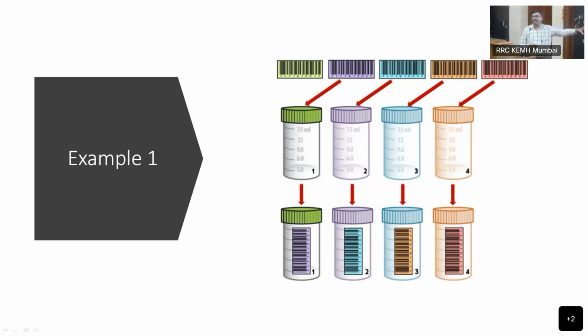Say someone who had gallbladder cancer got a urine report, someone with a kidney report got some other diagnosis altogether. So it was a garbled diagnosis they got for each individual patient. This happened only because she missed one sample in between and a complete frame shifting of samples happened. Why? Because she printed all the 25 barcodes at one time. Because of the frame shifting, what happened is that Shalini's sample went to Diya, Diya's went further ahead, and frame shifting happened.